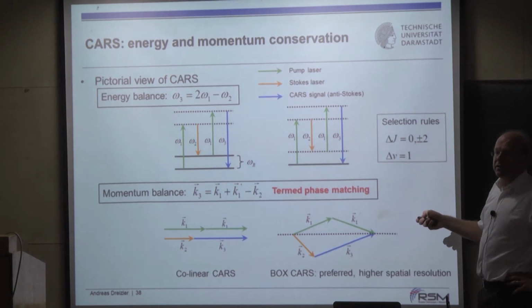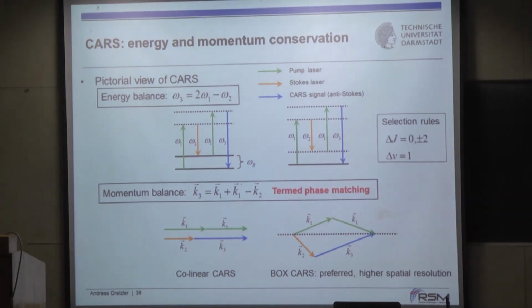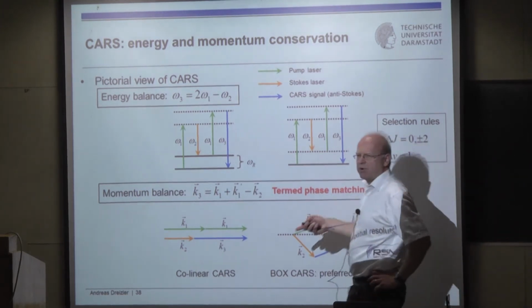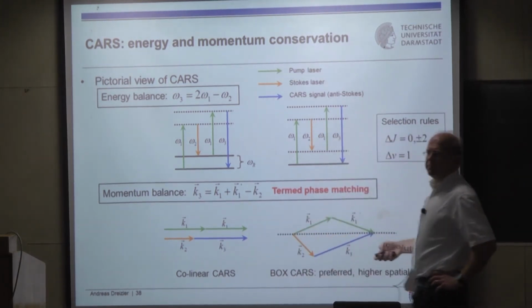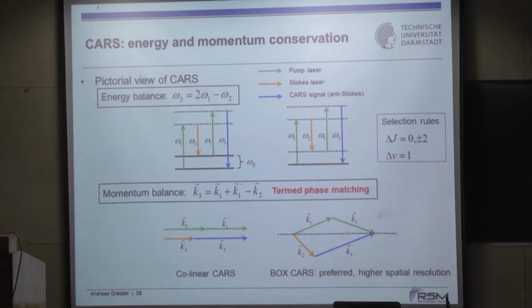If the second probe, yes, if that is different from 532, okay, no problem. You can do that, but then you need a third laser. It's just a question of money, and you can do that, no problem. People have done that with 3-color CARS. Okay, sorry for being slow in understanding what you want.